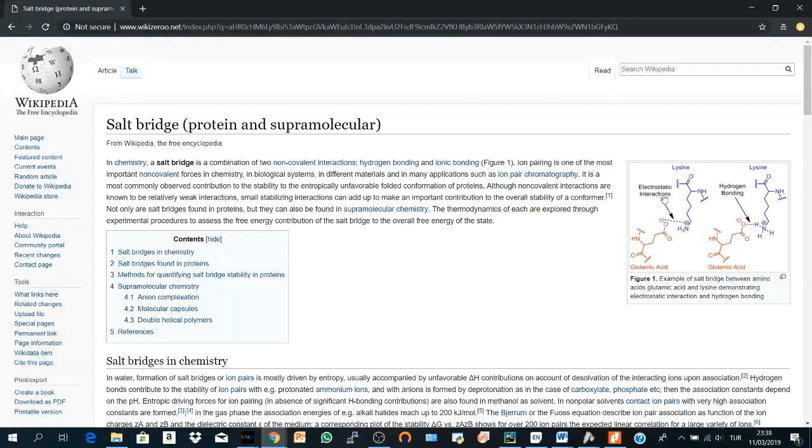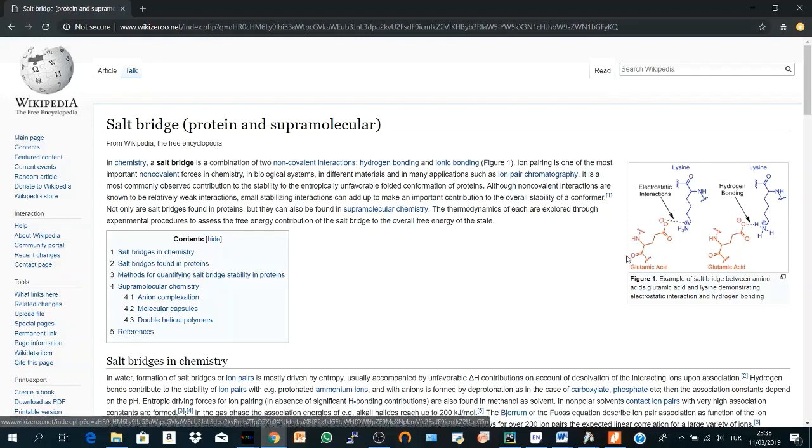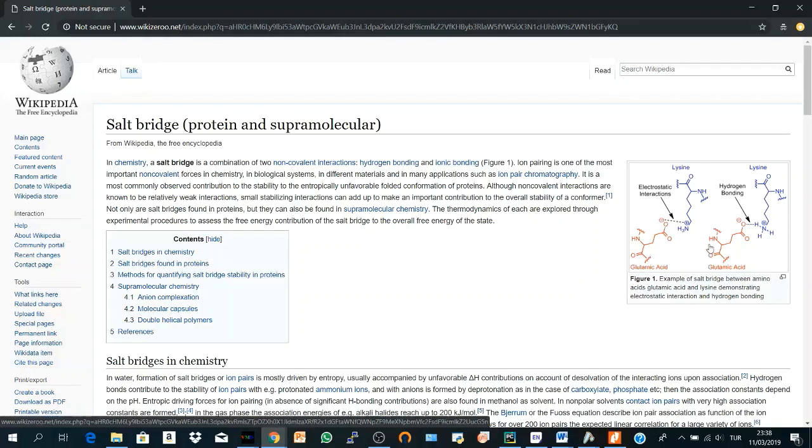Electrostatic interactions, which is a non-covalent interaction that happens between anions and cations, and hydrogen bonding which happens between the hydrogen or an oxygen or nitrogen of another amino acid.